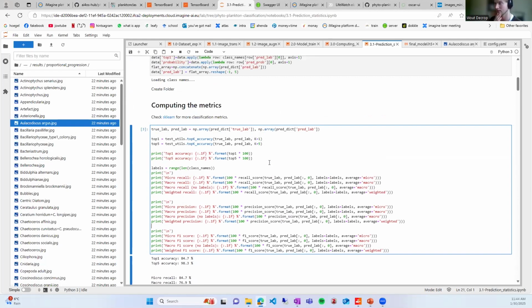But like I said, you check if you trust the class based on the general performance of the class. You can say it's 99% correct all the time. I don't want to check it, but if you do want to check everything, you can go by it manually. Can a human see the images for quality control?